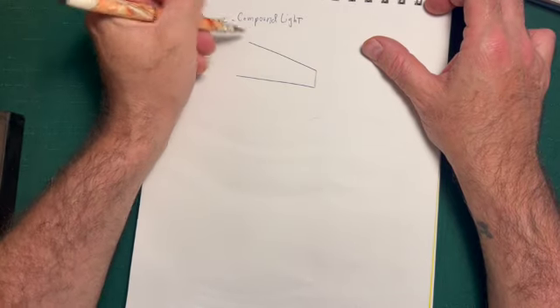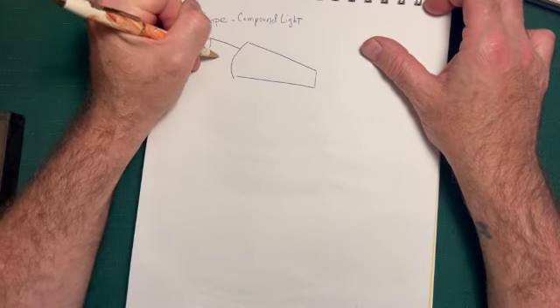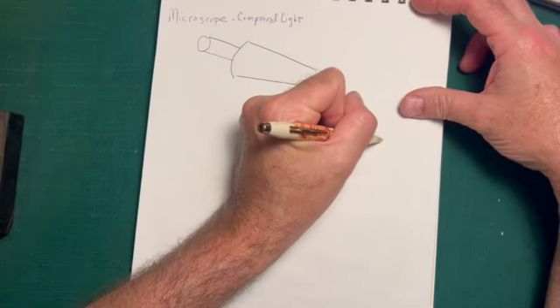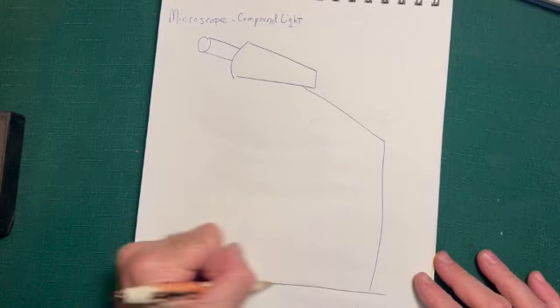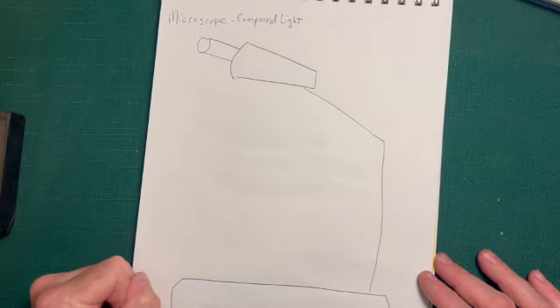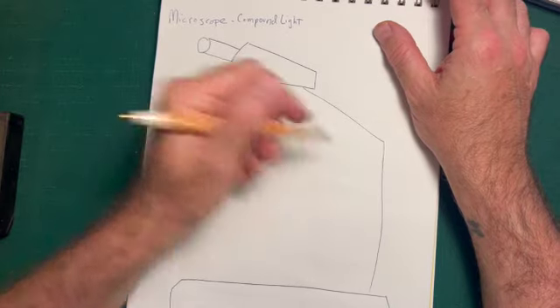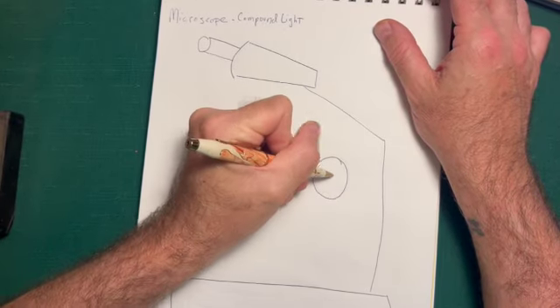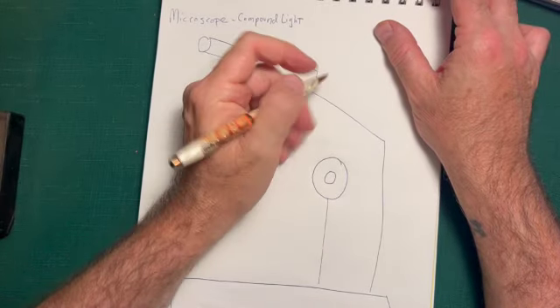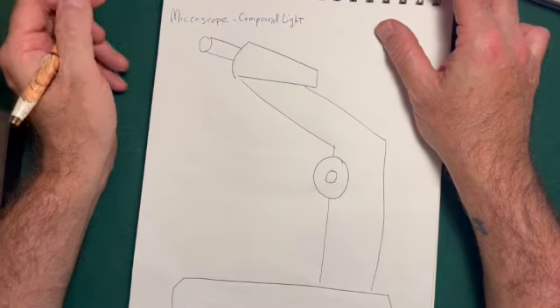Okay, so it's not particularly interesting, but there are a lot of parts that are helpful, and I'm going to draw basically without giving you much in the way of perspective, but just so that we have all the main parts there, so that if I show you a picture of a microscope on an exam, you will know where all the parts are. Okay, so, and connect that down here, bring that up there, and okay.